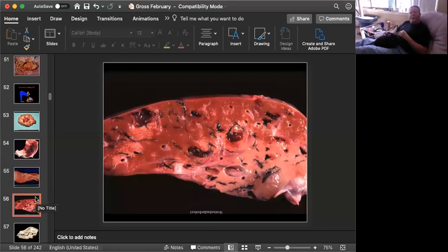Slide number 4 is tissue from an ox. Can you give me an etiologic diagnosis and the cause? Etiologic diagnosis is sort of shorthand. Instead of giving a full morphologic diagnosis, where we identify the process and the organ distribution, this one allows us just to quickly rattle off the organ and the agent.